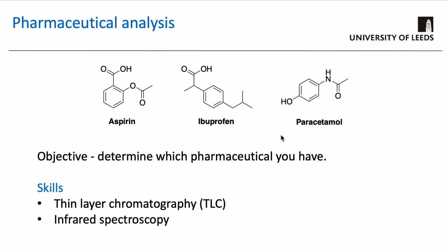By doing this, you will be learning how to perform a couple of standard techniques that we use to analyze the structure of organic molecules, which most drug molecules are. The skills you're going to use to do this will be thin layer chromatography and infrared spectroscopy.